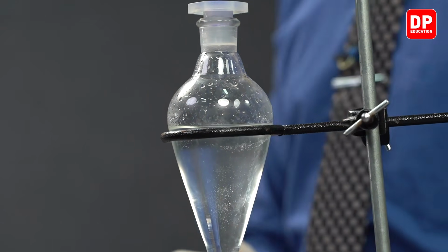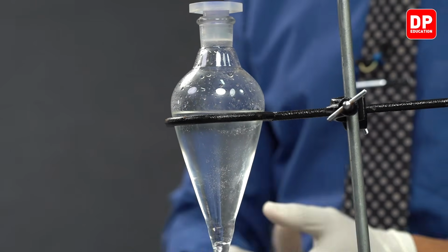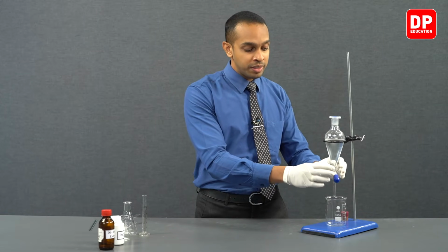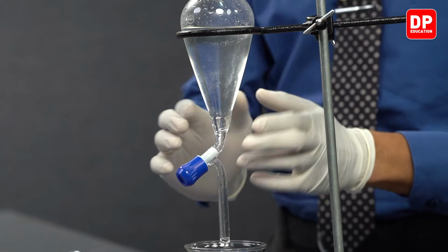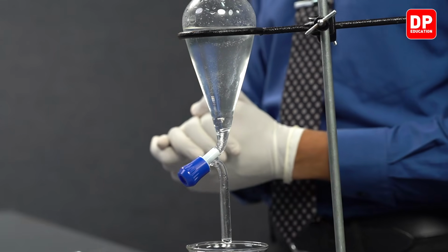You can't really see it now, but when we reduce the amount of aqueous layer by opening this stopcock, you will see as the aqueous layer gets collected to this beaker, around this area you will be able to very clearly see the diethyl ether layer.